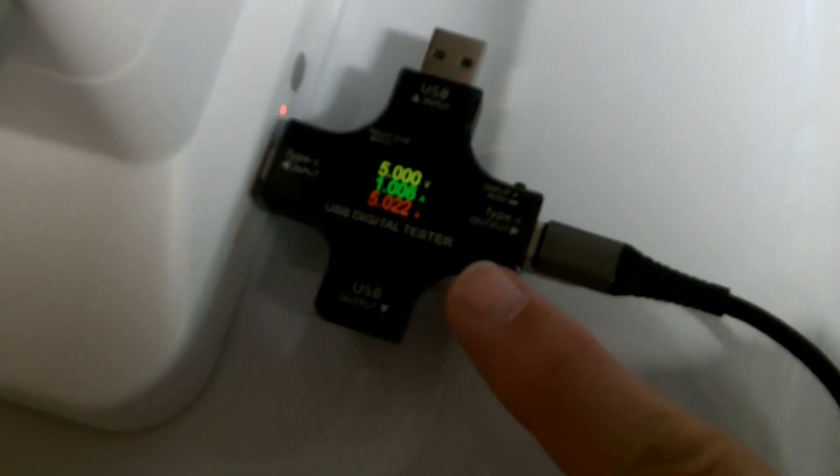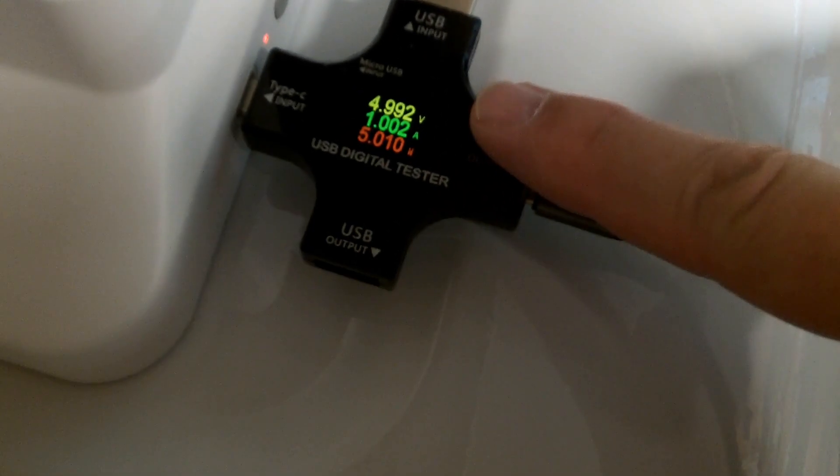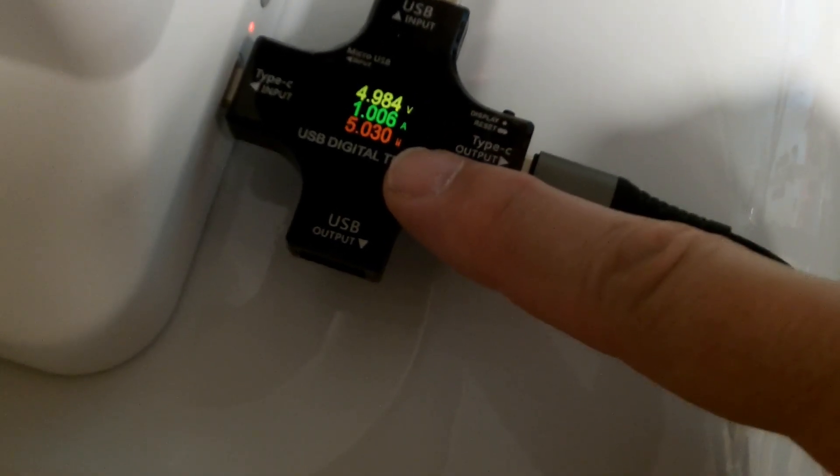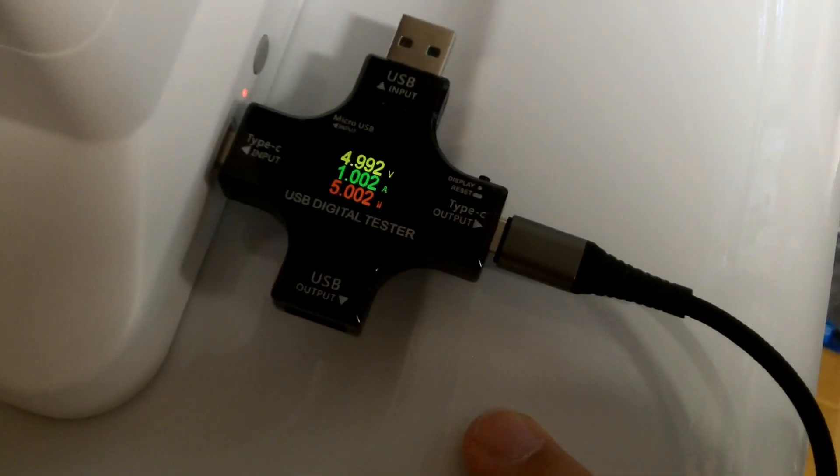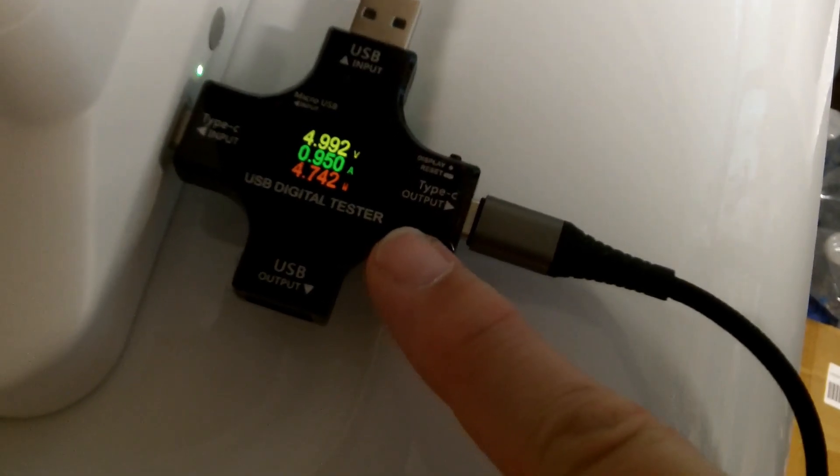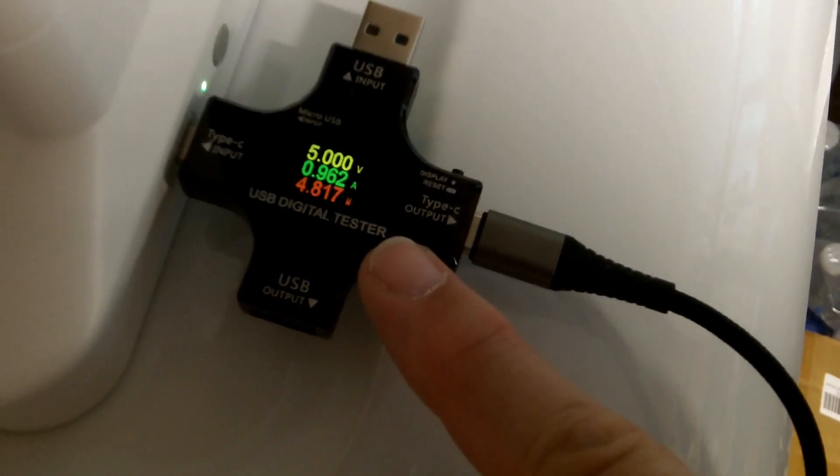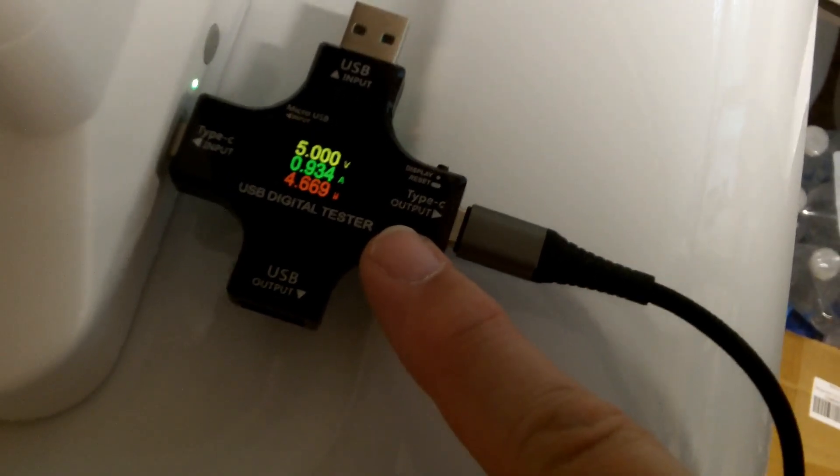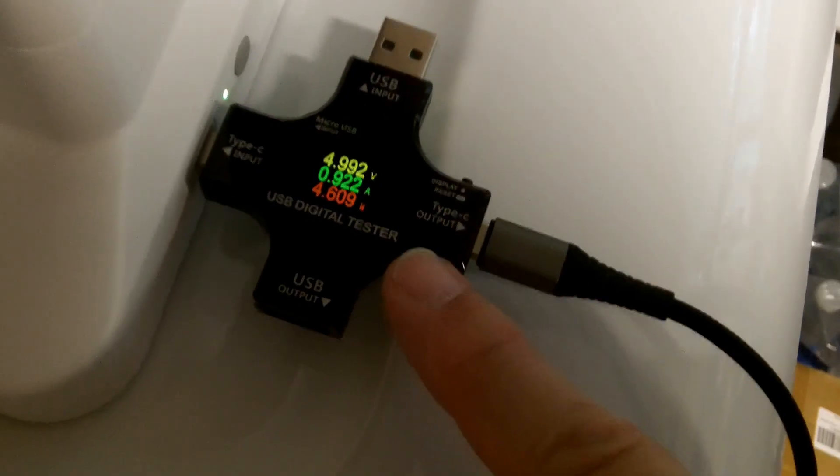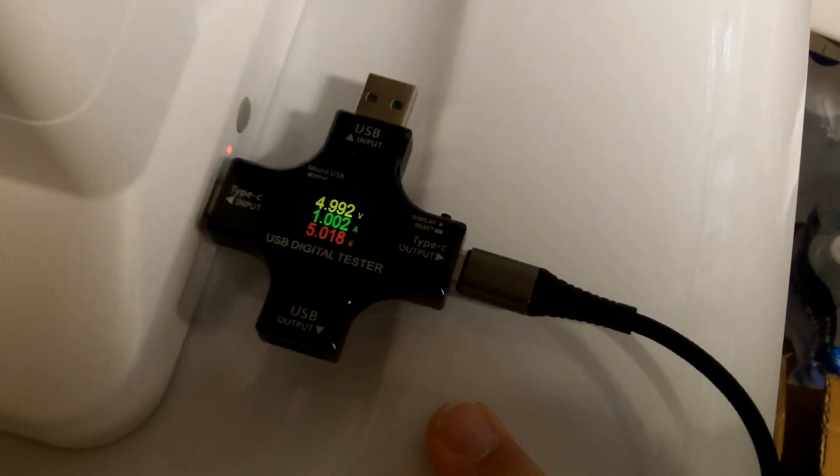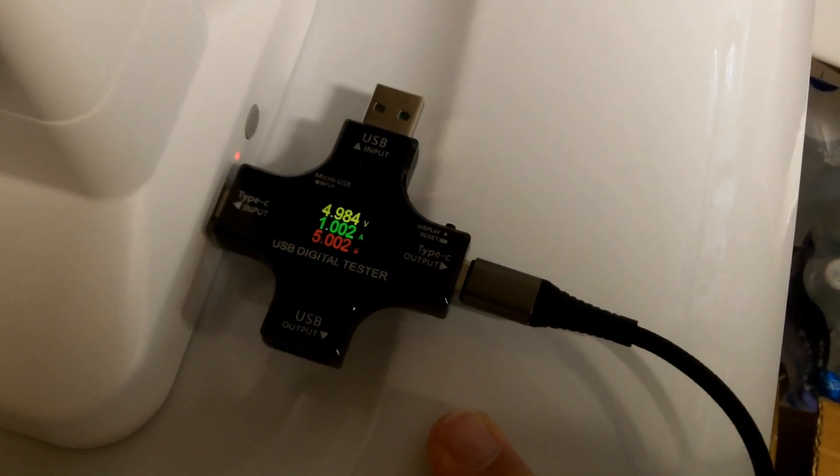It does look like the battery had gotten discharged in shipping. Right now, it's drawing 5 volts at 1 amp, and it's basically charging the battery at 5 watts. Now, it says it's a 2 amp device, so it may be that it takes 1 amp to run and 1 amp to charge the battery. I'm going to push the button, and there I turned it on, it's green now. And it's only drawing a little less than an amp now. Well, now it's jumped up to about an amp draw when it's turned on as well. I kind of suspect it's not charging the battery while it's running, and it's only running. And I'm going to turn off this guy. There we go. So I turned it off, and it's still drawing basically 1 amp. So I suspect it doesn't actually charge the battery while it's turned on. I think it only charges the battery when it's turned off.